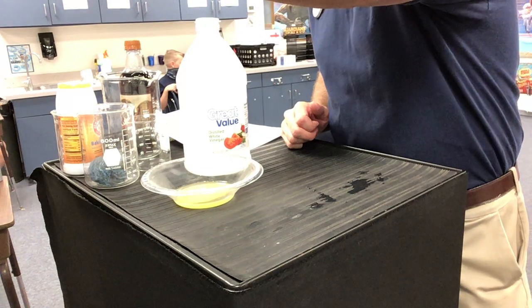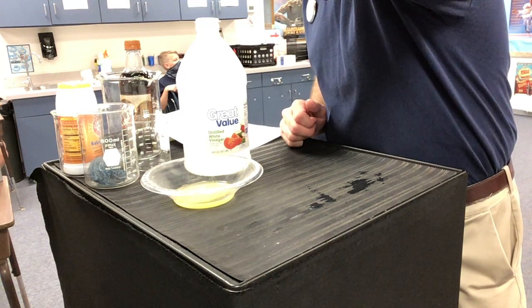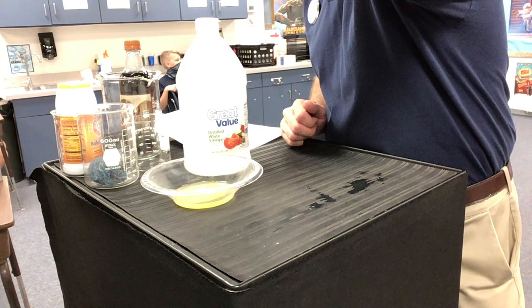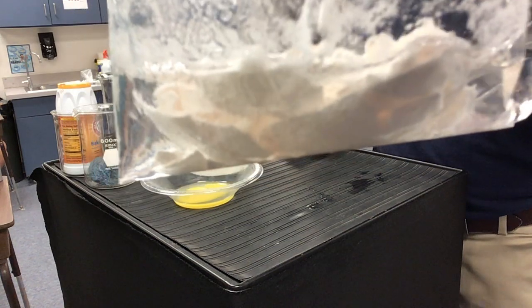But let's see. Trying to do it up close. See if you can see. Are there any bubbles being made? All right, again, up close for my online friends. Do you see some bubbles being produced?